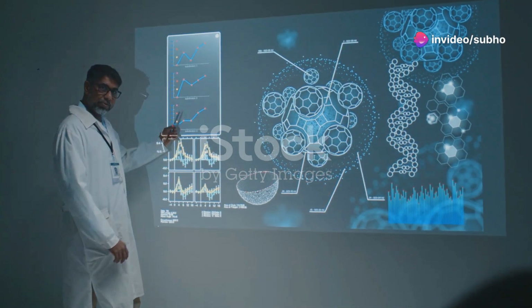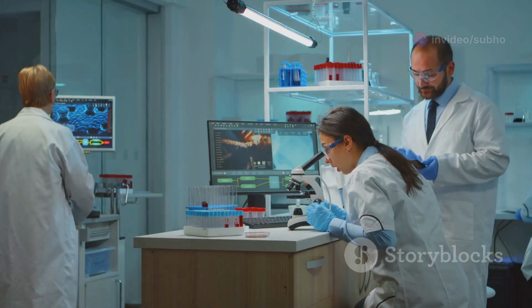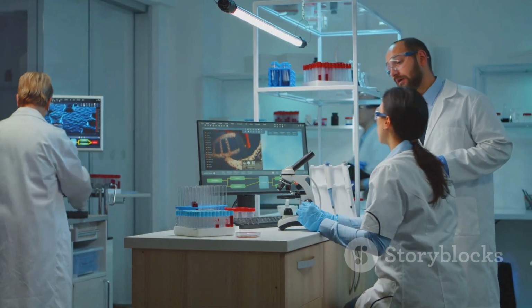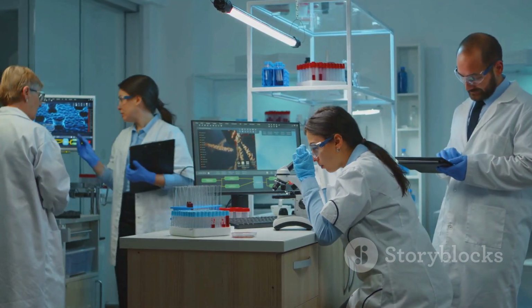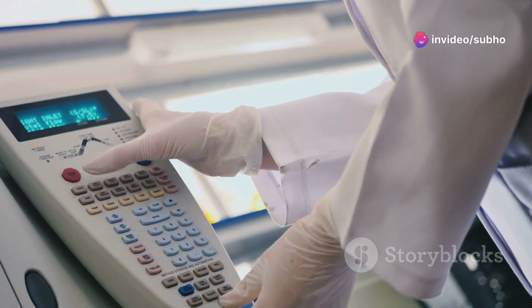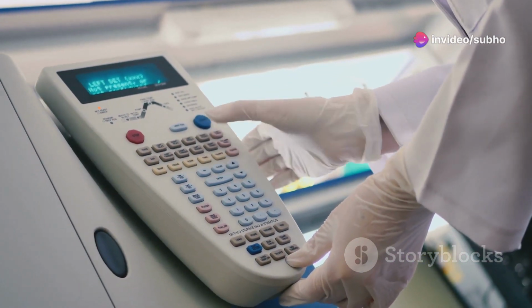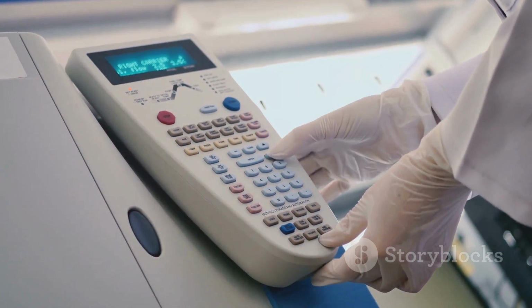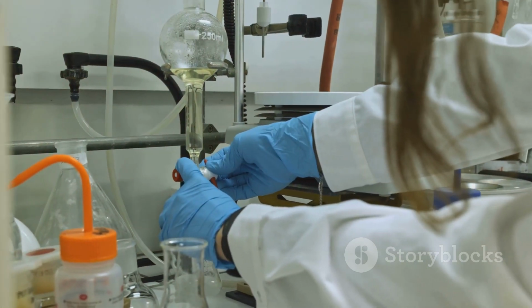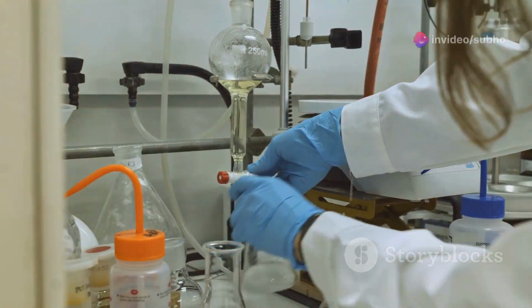Now that we know how Maldi-Tof MS works, let's talk about why it's such a game changer. This technique has a lot going for it, making it a favorite tool for scientists worldwide. First off, it's incredibly fast. Remember that molecular race we talked about? It happens in the blink of an eye, allowing scientists to analyze numerous samples in a short amount of time. This high-throughput screening is invaluable in fields like drug discovery, where time is of the essence.